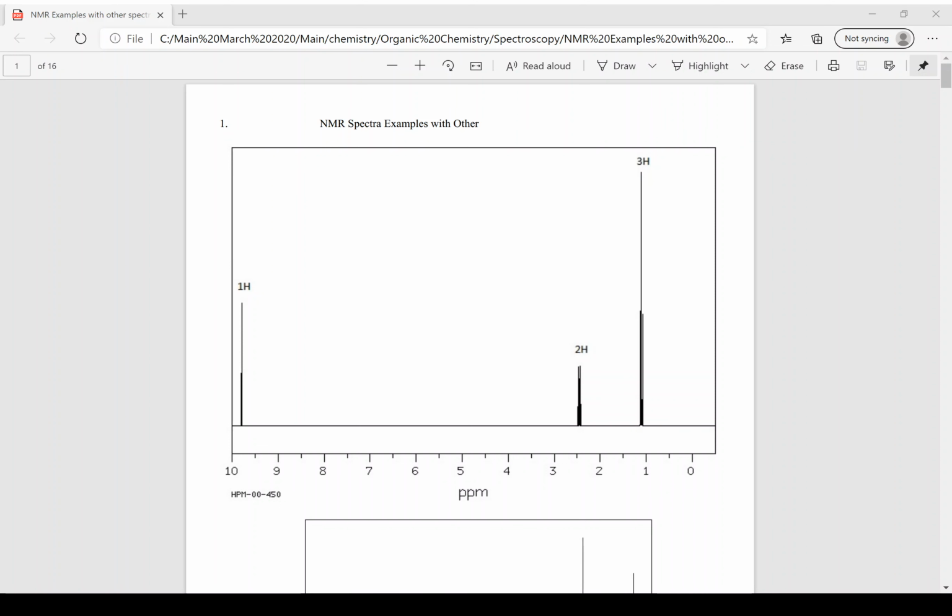Because I have 4 spectra, I'm going to glean as much information as I can from each spectrum before going back. Now remember, there are lots of problems individually for carbon-13, proton, and IR, and I highly suggest you do each of those first before you try to put them together. I will also put a PDF with all of these worked out in their gory detail under the reference for Moodle for you.